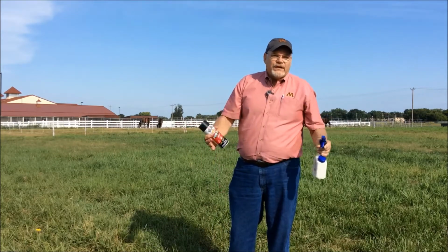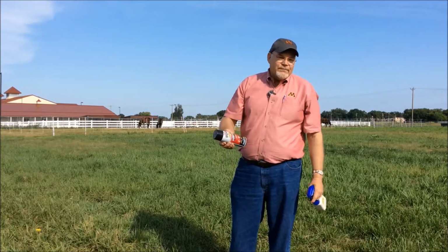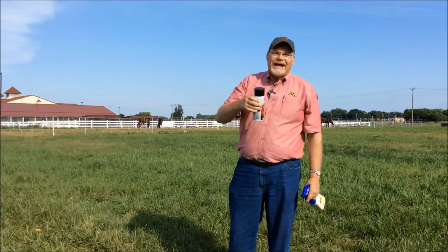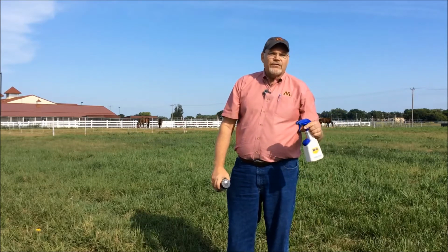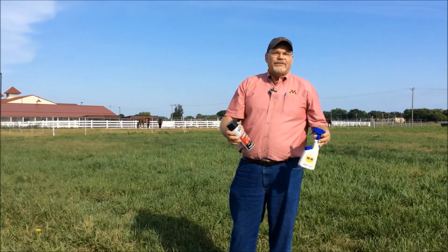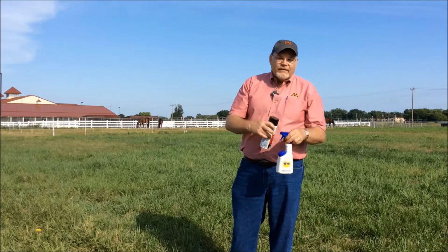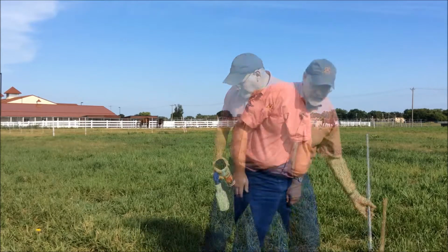And one last thing, if you're in a situation where it comes to sampling and you're using a probe and the soil is sticky, sometimes you need a lubricant, and there's several that can be used. One of them I've got here is a silicone spray, fairly inert, won't add to the analysis. We tend to use in a lot of our nutrient management things WD-40. Again, there isn't enough in it to affect the analysis in the soil sample. When it's dry, not as much needed, but that's one of the tricks of the trade.